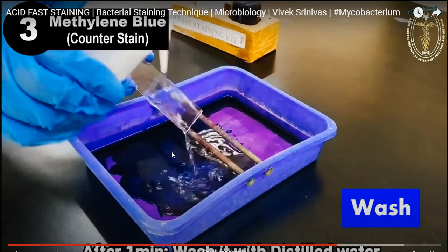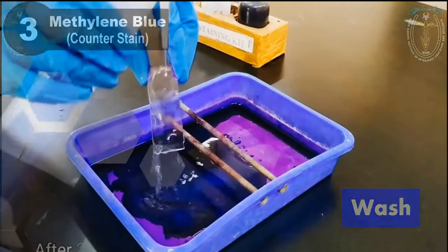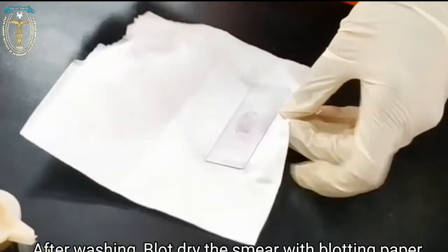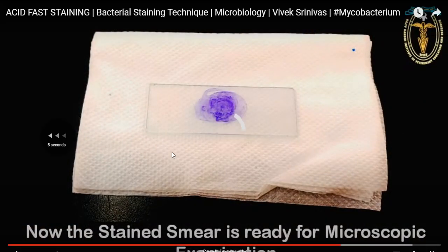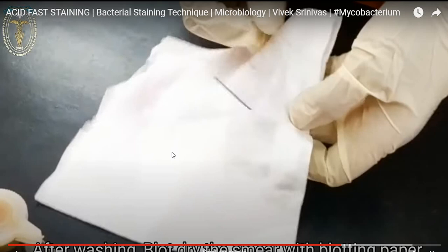After washing, blot dry the smear using the blotting paper or tissue paper. Okay? Ang blotting is gina-tap niya lang. Do not wipe the smear. Okay? Just tap it. On microscopic examination following the Acidfast staining technique, these Acidfast bacteria stain pink, which are slender rods, and they are arranged in a bundle of faggot arrangement. Due to the methylene blue counterstain, the background is stained blue. This background gives a good contrast for the Acidfast bacteria in pink. So, the result is written as the smear prepared from the sample, stained using the Acidfast staining technique is positive for Acidfast bacteria with the bundle of faggot arrangement.